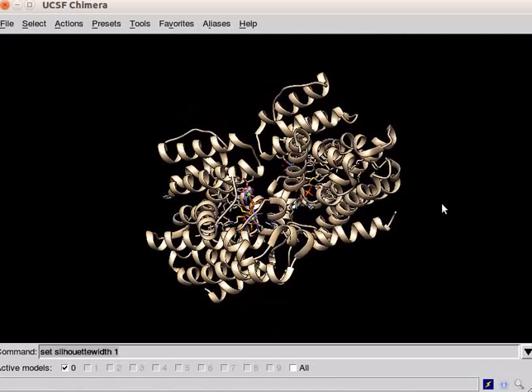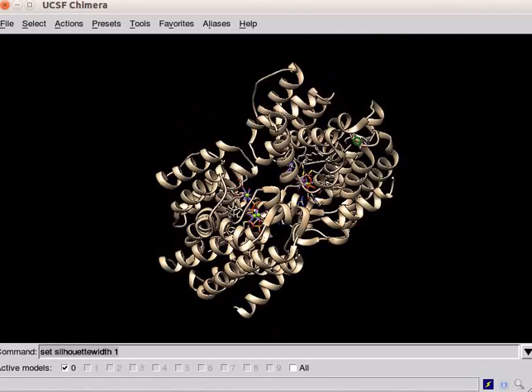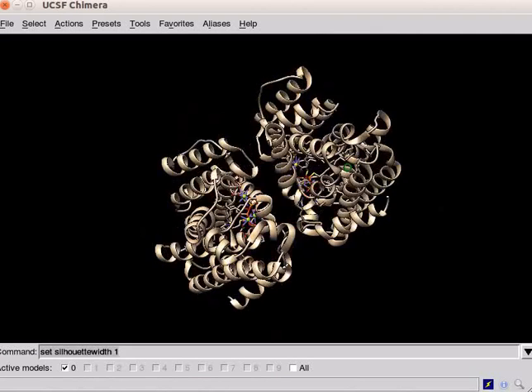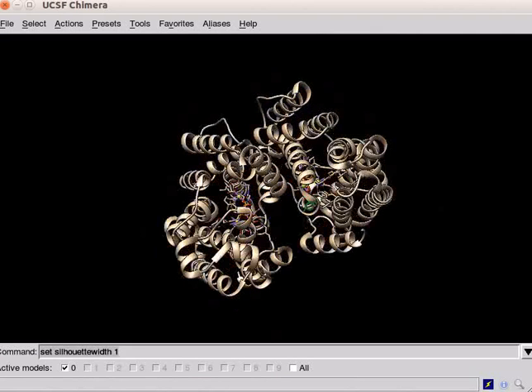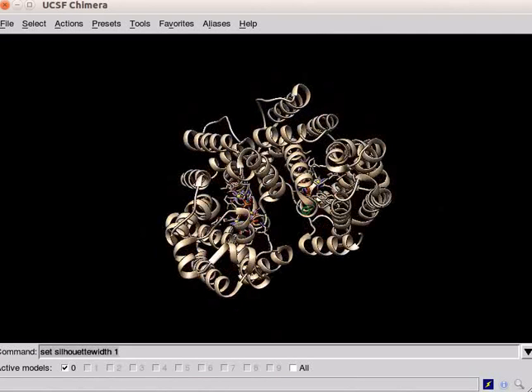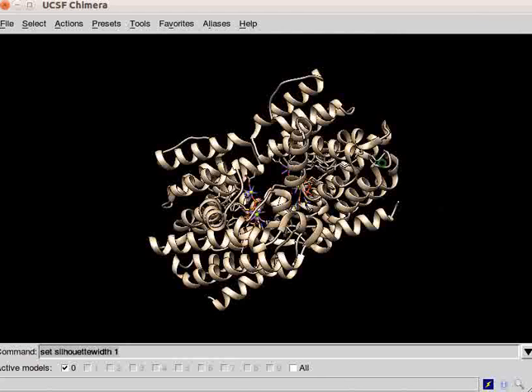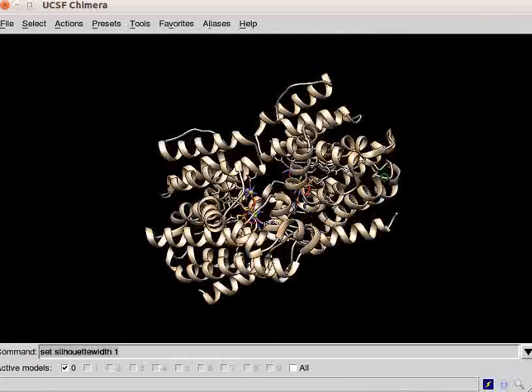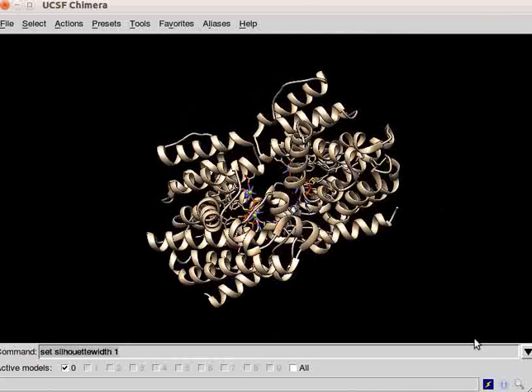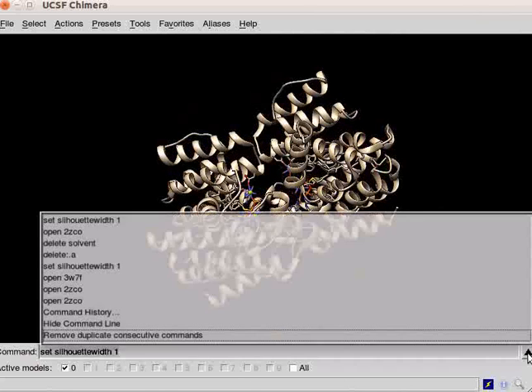The structure of squalene synthase opens on the screen. Now, let us prepare this structure for superimposing. It contains two copies of the same protein. Using the command line, delete one of the chains.